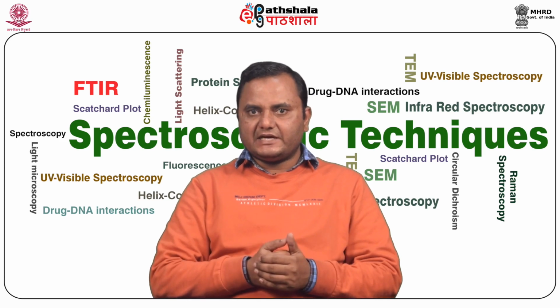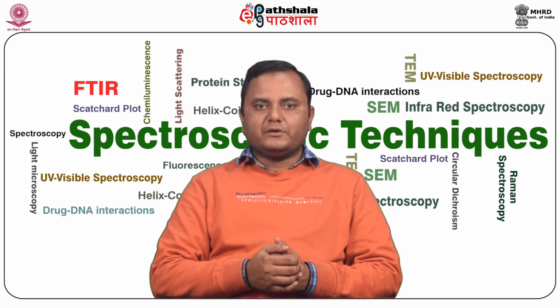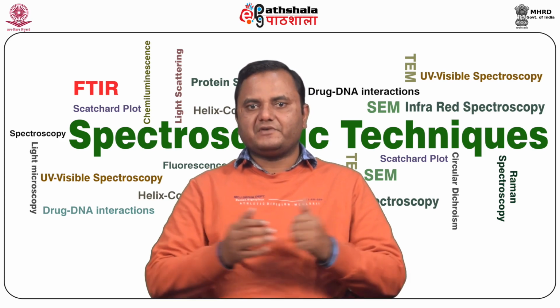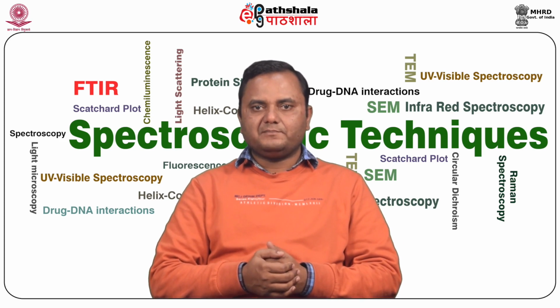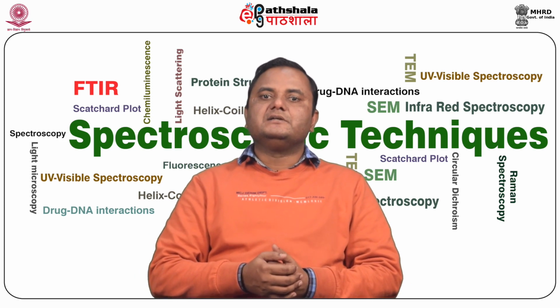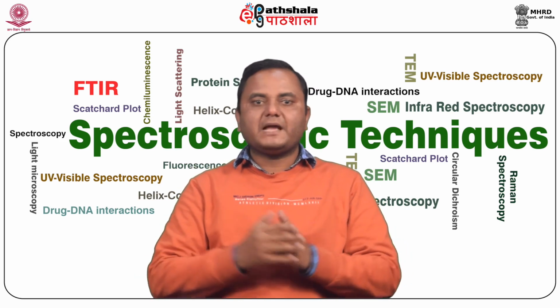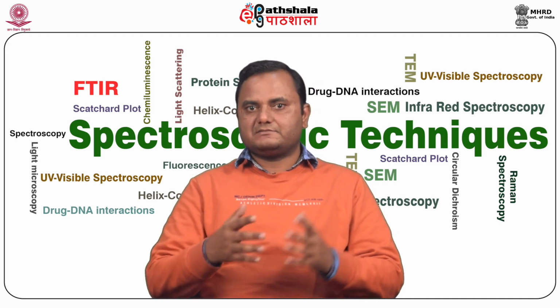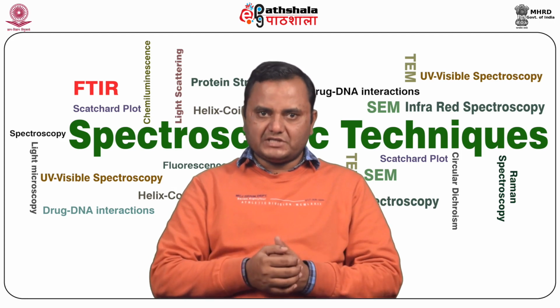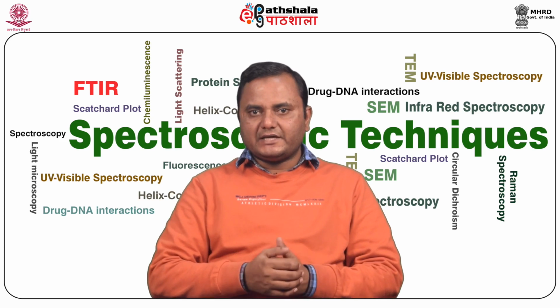maximum ellipticity at 250 per mole per centimeter, tyrosine has 1000 per mole per centimeter, and tryptophan has 5000 per mole per centimeter, and this property is used for the estimation of the tertiary structure of a protein. However, the backbone or amide bond is detected in the far UV region, where n to pi transition occurs at approximately 210 to 220 nanometer.